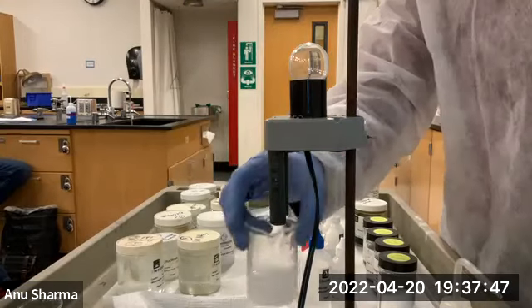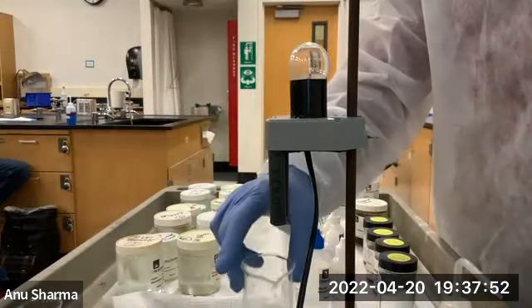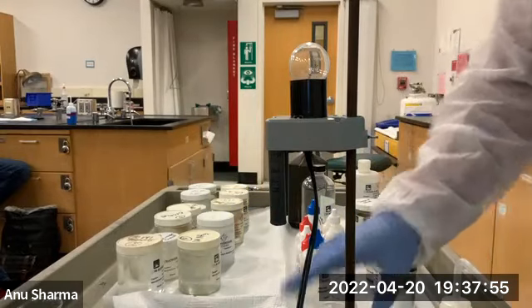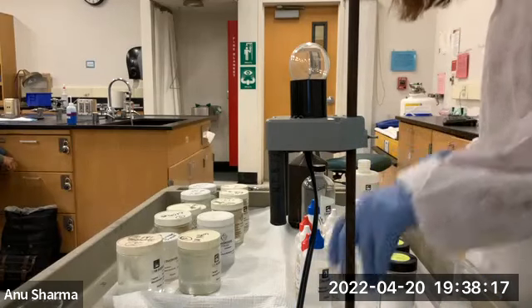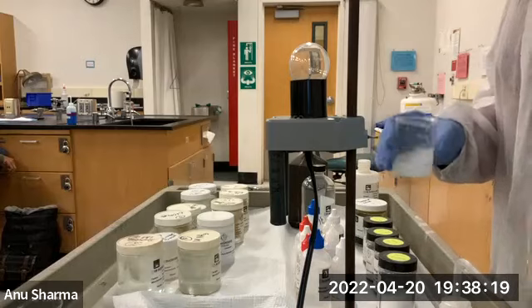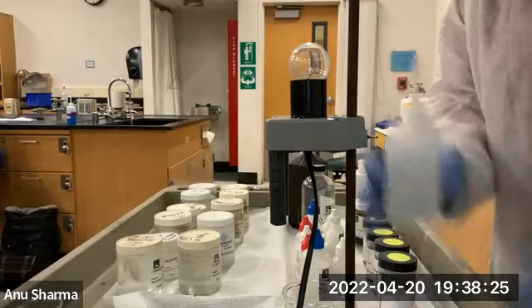But ideally, I shouldn't see the glow. So you can write this down: conductivity before mixing is strong, but the reaction is still occurring, so that's why you see the lighted bulb. Once the reaction is done, it is not going to be a good conductor of electricity because barium sulfate does not dissolve in water. Okay, I'm going to just leave it here. Maybe once it's done, we can look at other things.